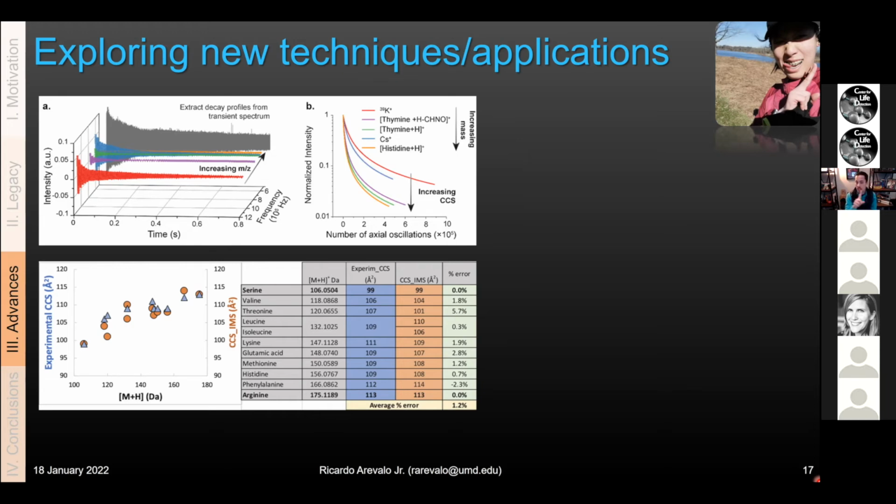Eventually that signal decays away, right? Because it's an imperfect vacuum, an imperfect squeezed football because someone's got to machine it. You've got other ions in there that are competing for that volume as well. So there's a decay rate of the signal intensity for everything that's in there. That decay rate can also give you information about what that molecular identity is.